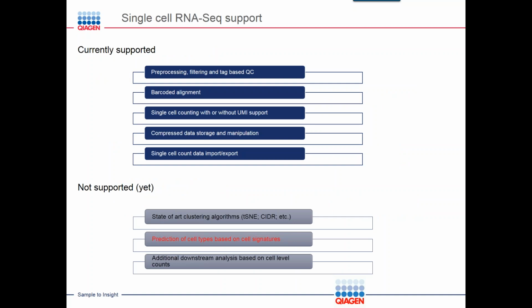So the next one I want to talk about is single-cell RNA-Seq support. We have been working on this for over a year now, and pretty much every company has already started this new technology, or is about to start. So there are lots of things going on with single-cell RNA-Seq. I think we have achieved a lot, but I also want you to be clear on what has been available and what has not been available.